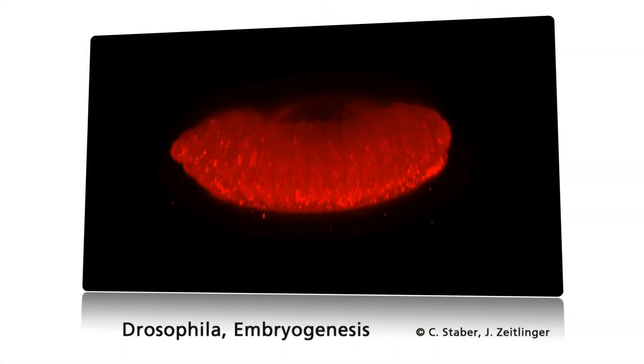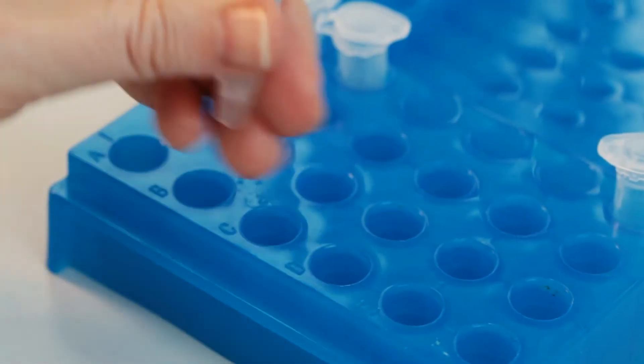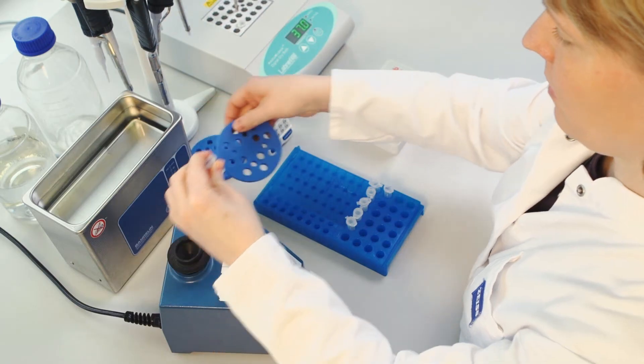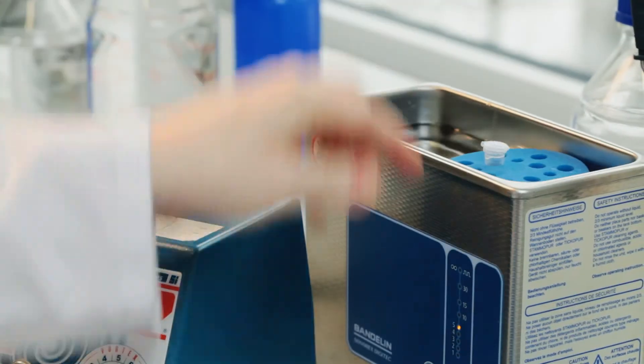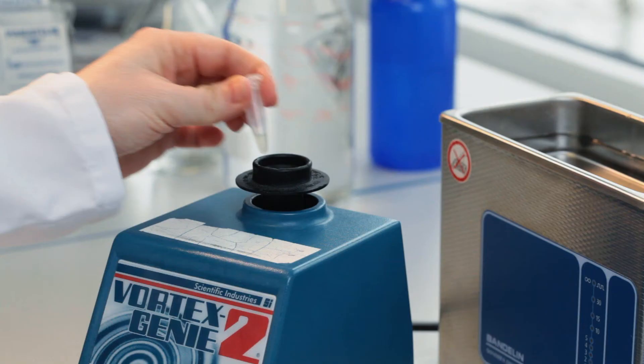Fluorescent beads will serve as fiducials for later multi-view alignment. Simply mix them with the medium by repeatedly vortexing and sonicating. Then add them to the agarose and vortex again.